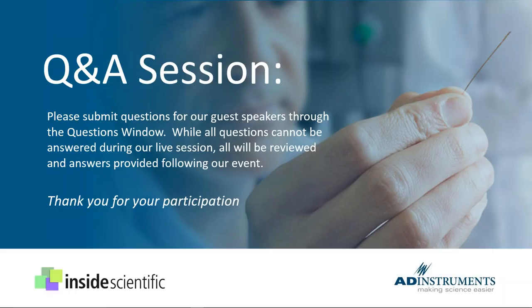All right, question from Mark Kearns. He states he often obtains very clean-looking hypertonic saline calibrations, so good for you, Mark.